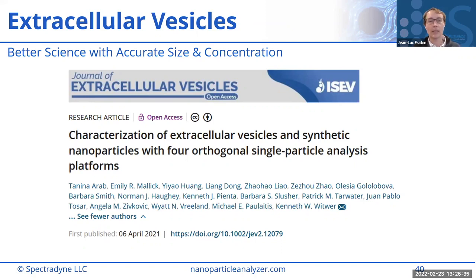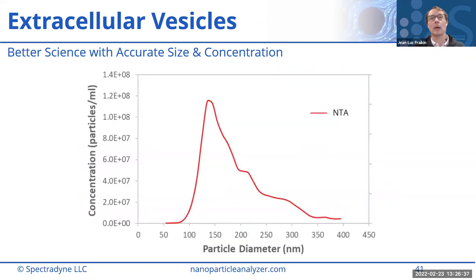Okay, so back to our experiment. This is a real measurement now of extracellular vesicles by NTA, and this is a fairly typical measurement for an EV sample by NTA.